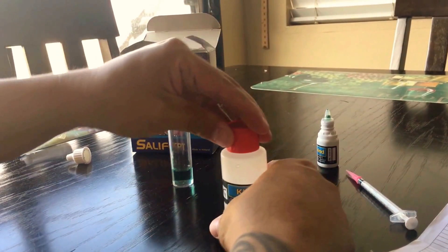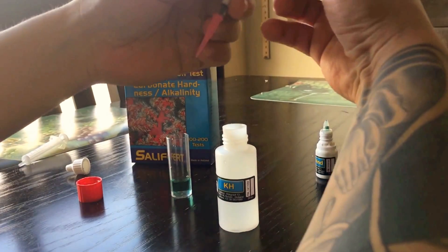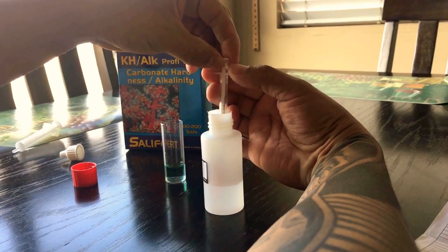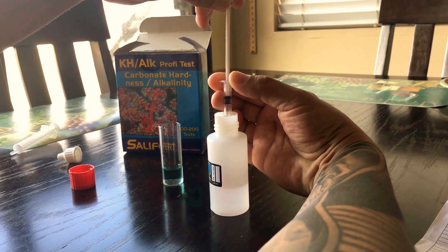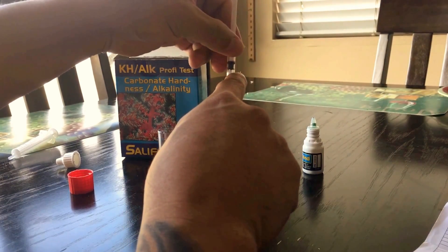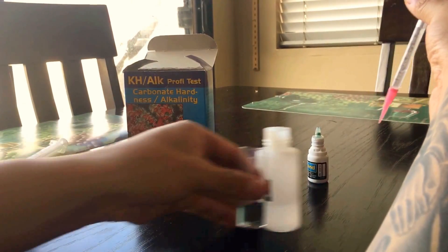Then you're gonna use the other solution with the second syringe — fill it to the one milliliter mark. The mark is on the bottom part of the syringe, right here — you can see it. That's the mark. Not the upper one, the bottom one.